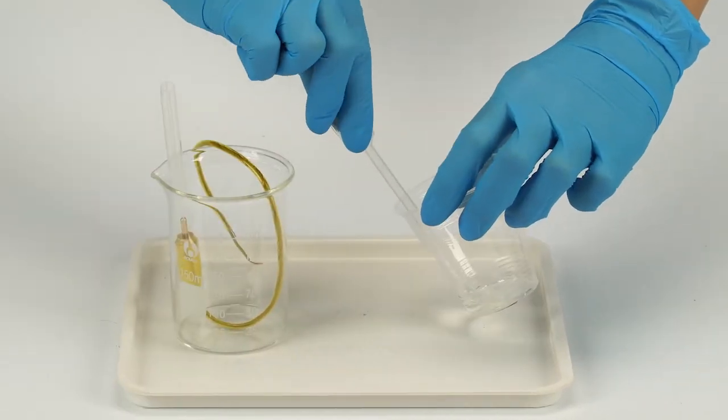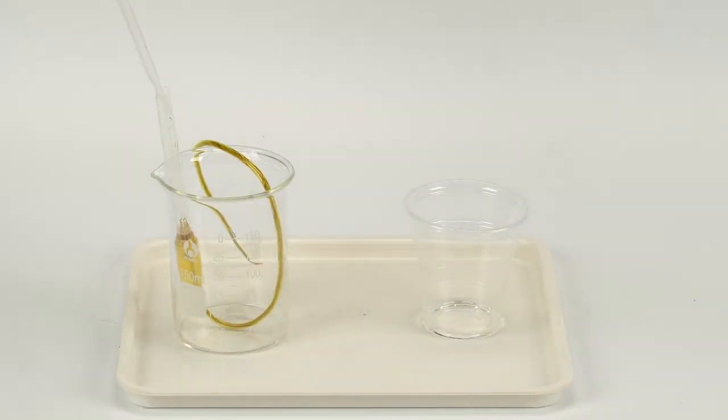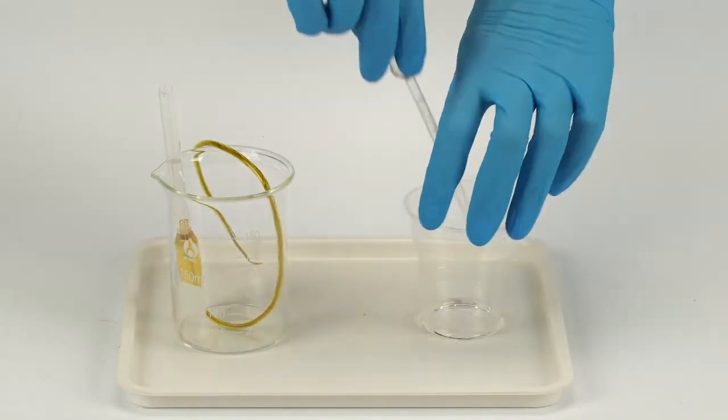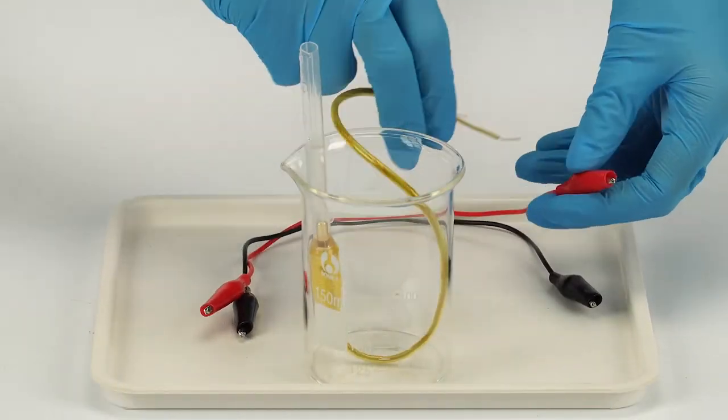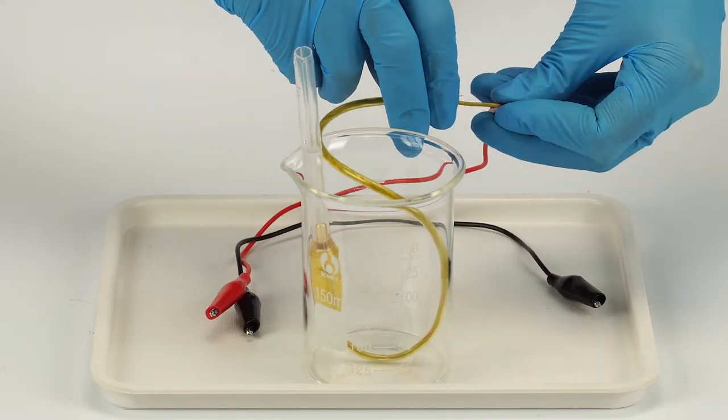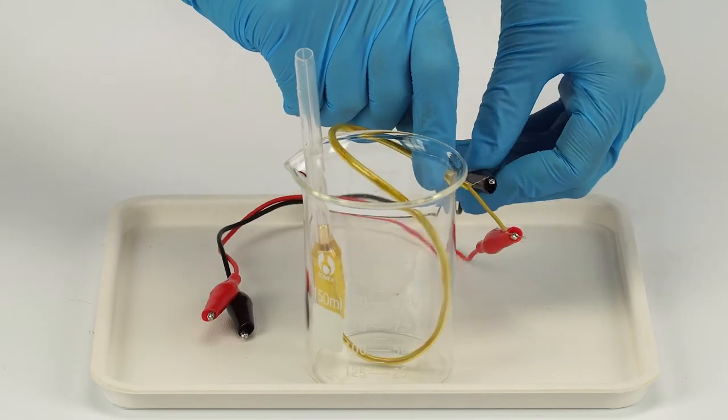Fill the setup pipette halfway with sodium hydroxide NaOH solution. Use a pipette. Hook up the crocodile clips. The red clip to the longer wire and the black clip to the shorter wire.